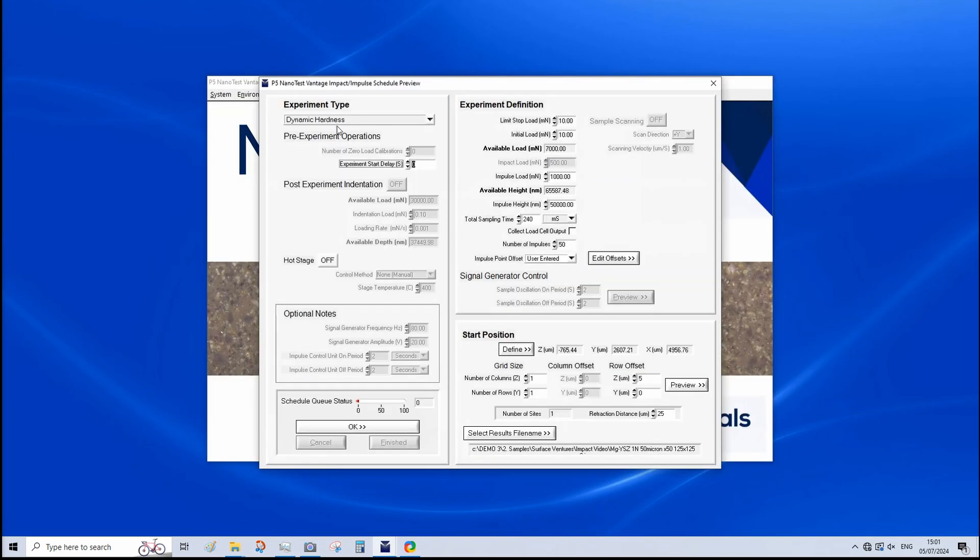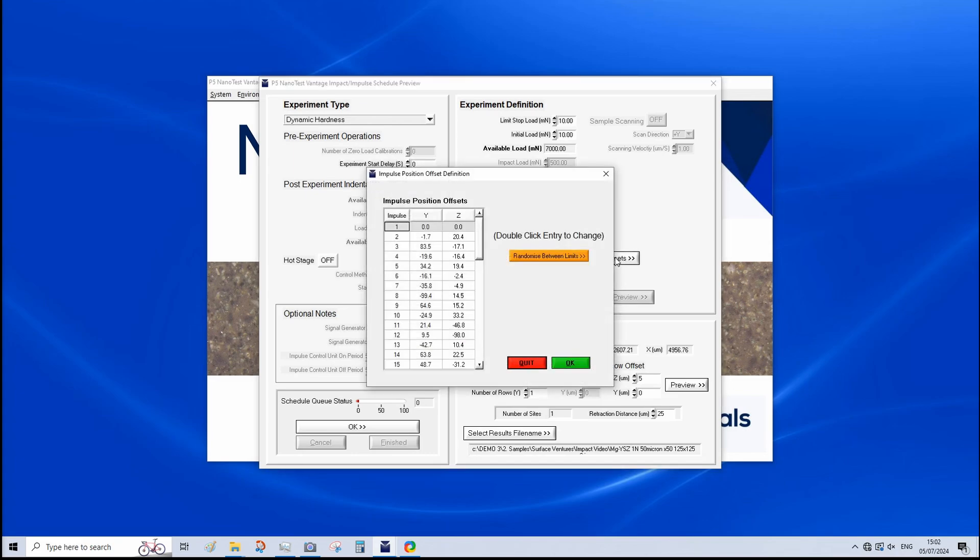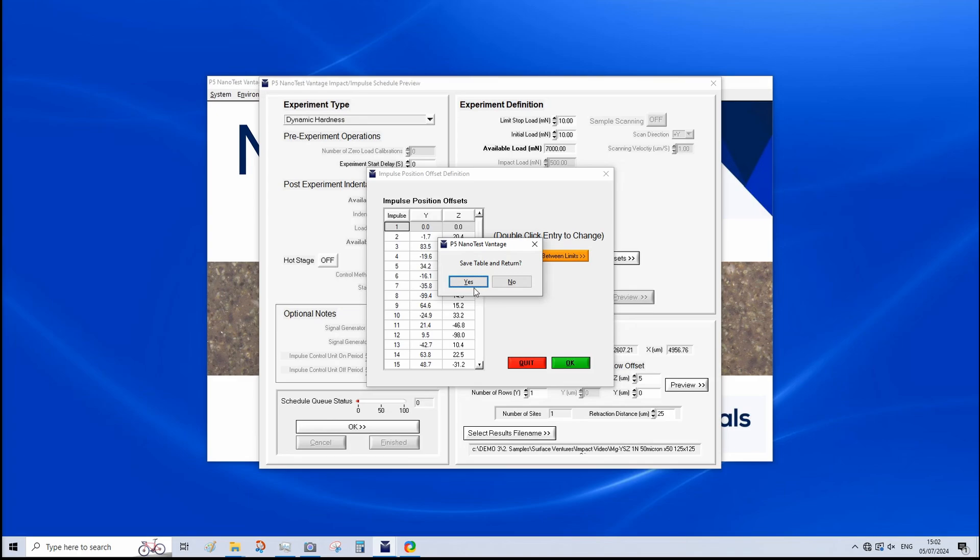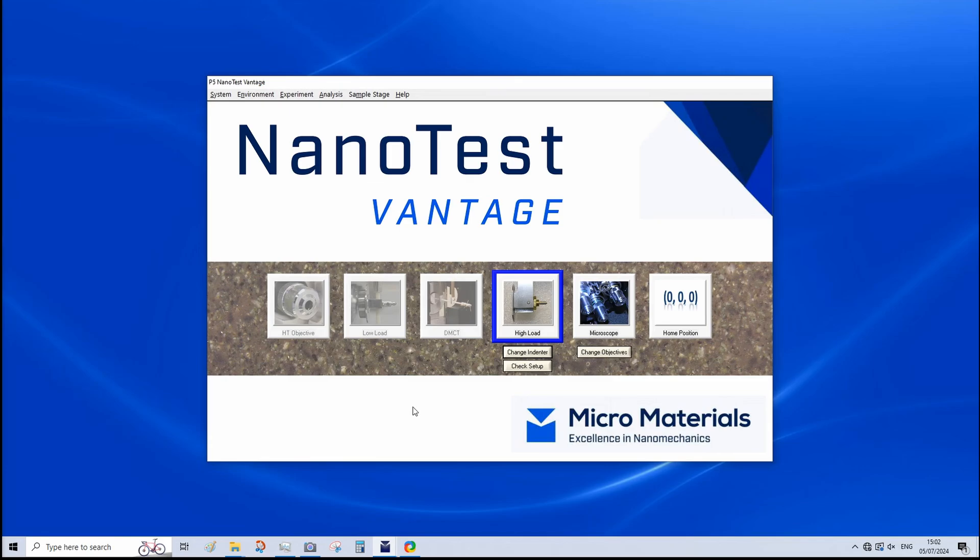We have selected dynamic hardness as we are performing multiple single impacts with changing position. We have an impulse load of 1000 millinewtons or 1 newton. And impulse height of 50 microns. Same total sampling time as before. 50 impacts. And to set up our area, we have impulse point offset, user entered, edit offsets. And then we would set the plus and minus displacement between Y and Z. So, we're going to click OK on that. And now that this is all set up, we're going to click OK. Finished. And then we can run our test.